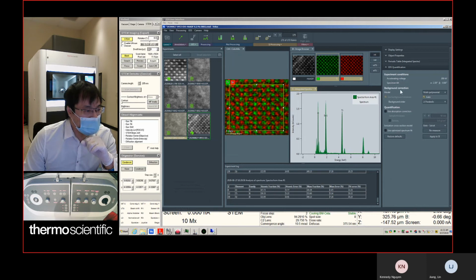So there's a background correction model. The first thing we need to do to say which one's good is to show the background. If you click this window here, you can just select background and make the background visible, and also you can make the model visible.